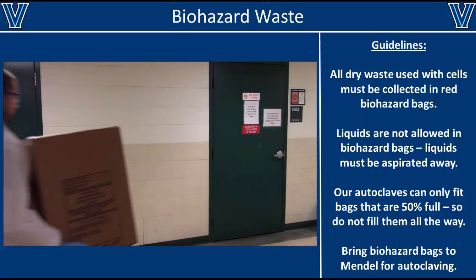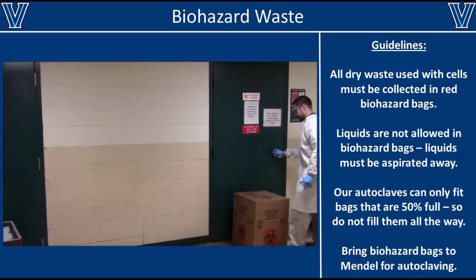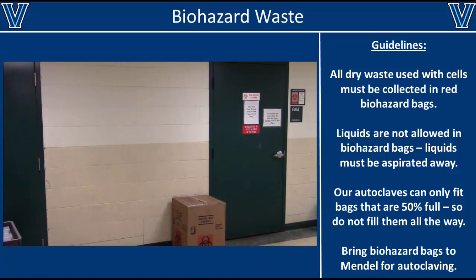Once the box has been properly sealed, take it down to the basement of Mendel to dispose of it. Ideally, biohazard waste boxes should be collected in room G04, but if the door is locked, you can leave the box outside of the door.